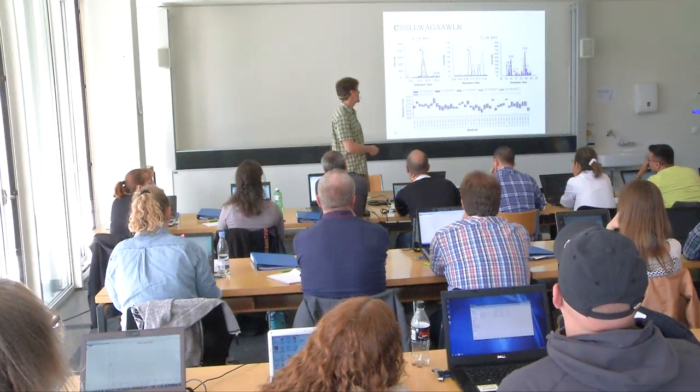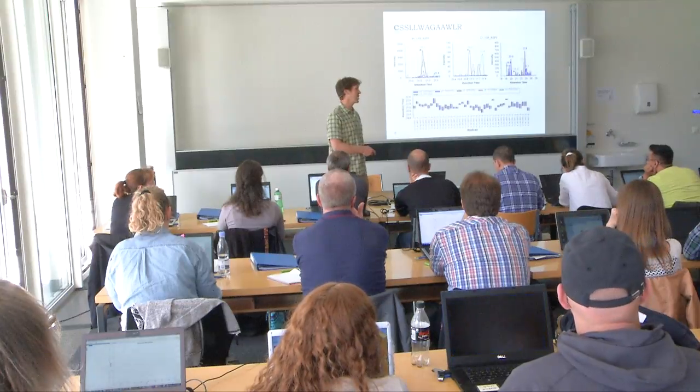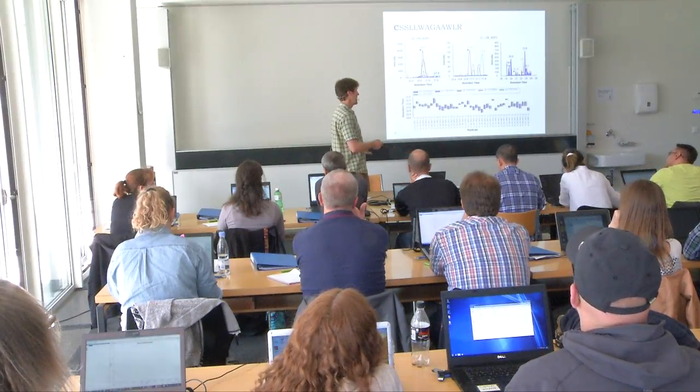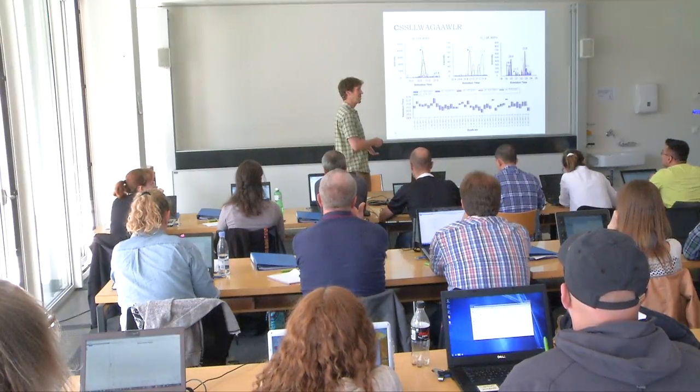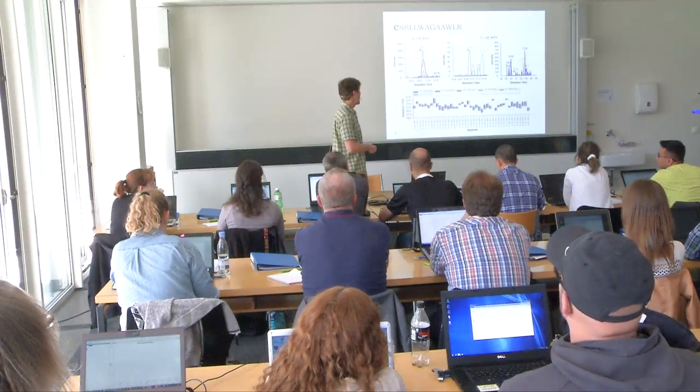And it would have been a lot nicer if this data were randomized. But since it's measured in 3 cycles, it's extremely unlikely that this peak is just moving outside the retention time window and then back again, out and back again.